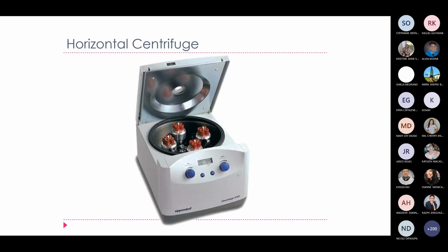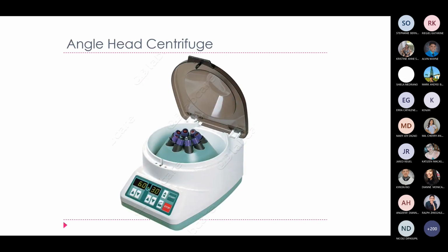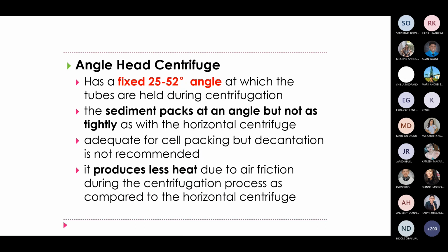Okay, so another type of centrifuge. We have the angle head centrifuge. What is the other term for angle head centrifuge? Also known as fixed angle type of centrifuge.